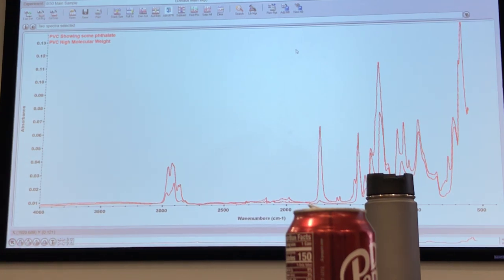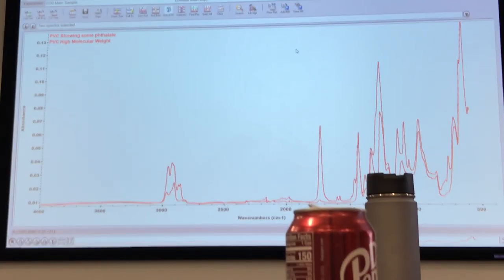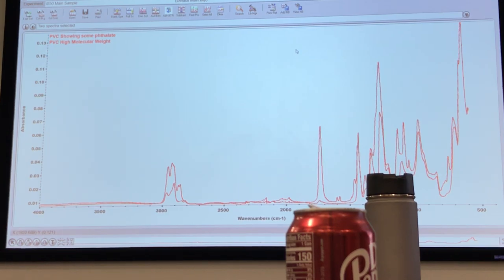So I really will encourage you to at least have what we call a library of all the things that you have seen so far, because contaminations always repeat. They always repeat. Why I say this is, when we get samples in the lab from a lot of different industries, can anybody guess what would be the most common contaminant? Make a couple of guesses, actually. Polyethylene. More guesses. If it's water. A particle. Pardon me?